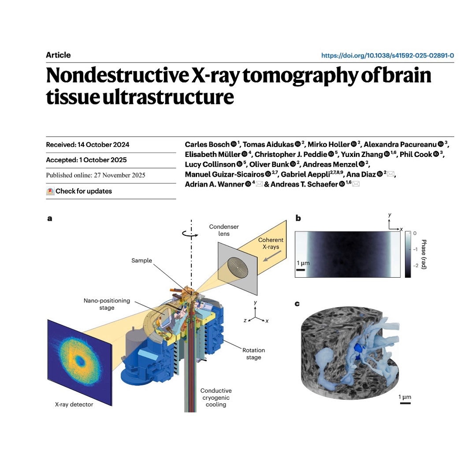For years, the gold standard for that level of detail has been something called volume electron microscopy, or EM. EM gives you those beautiful high-resolution images, but it has a fundamental physical limitation. It absolutely does. The electrons you need for the imaging get stopped very easily by dense tissue. So they can't see very deep. Not at all. Their penetration is limited to just a few hundred nanometers. So if you want a 3D image of a chunk of tissue, you can't just look through it. You have to physically take it apart.